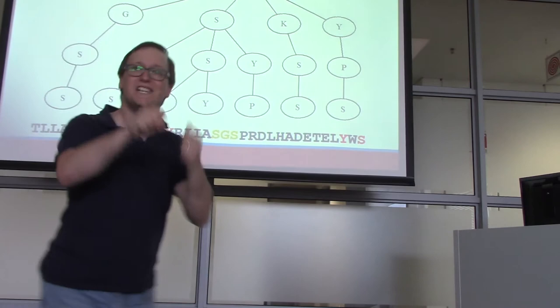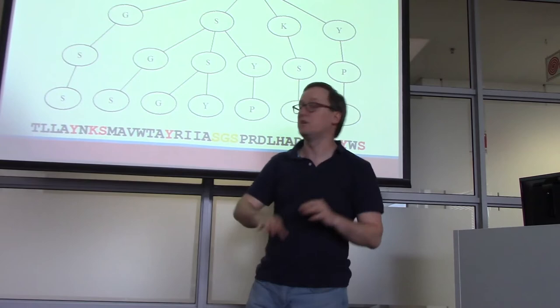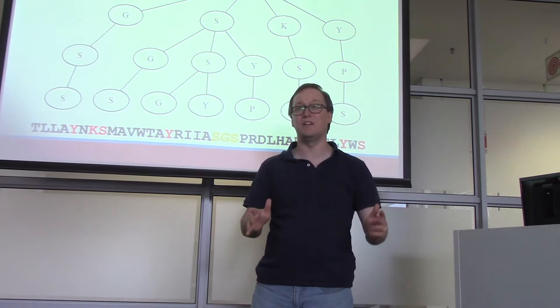We've got a hit. By having moved through this data structure, by getting a pointer advanced all the way down to the bottom, the software recognizes, yes, there's a common three-letter sequence between the query sequence and this particular entry in the database. And it can do that with one pass through the database. Find all instances of any three-letter combination from the query sequence. I think that's amazingly cool. Very useful kind of structure to know.